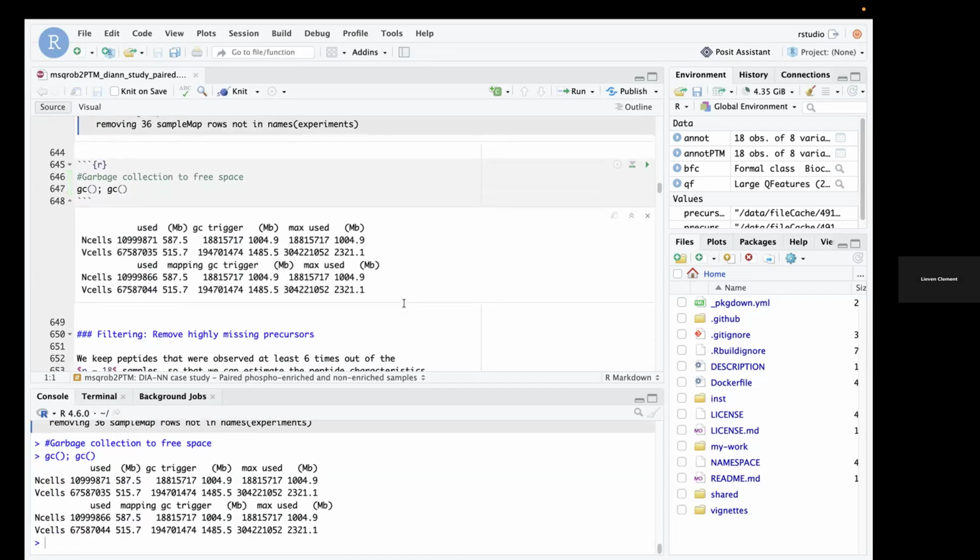What? Because I never have trouble with the memory. I would do that for single cell data for sure, but up to now, if I'm just having typical bulk data sets, yeah, and then I can still retrieve all the information that is in there, but that's what we typically do.